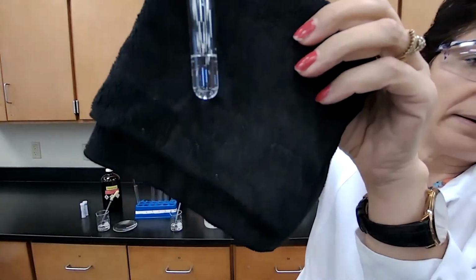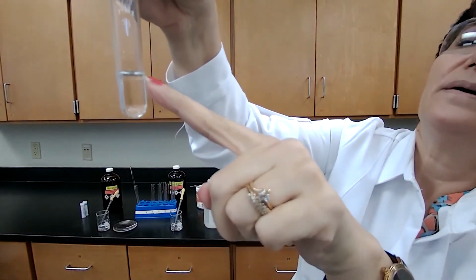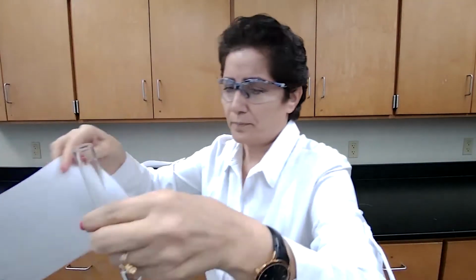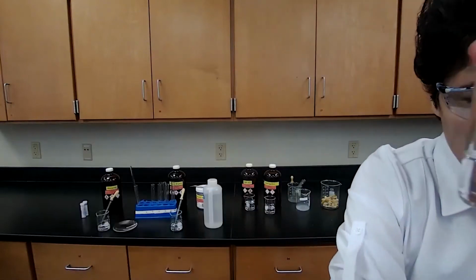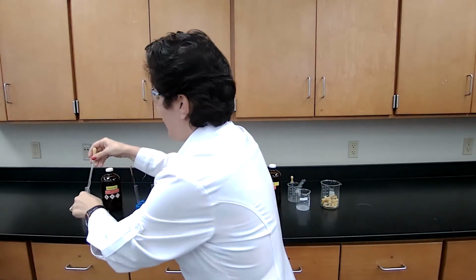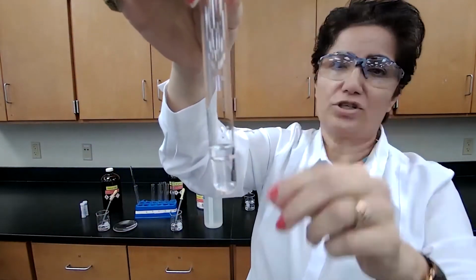So you can see the two layers are forming. Maybe without the background, you could see the two layers are forming. There's like one layer or maybe a white background. No. Okay. So because it's hard to see it, I'm going to add more. When you add more, that layer gets thicker. And now you can see it much better.